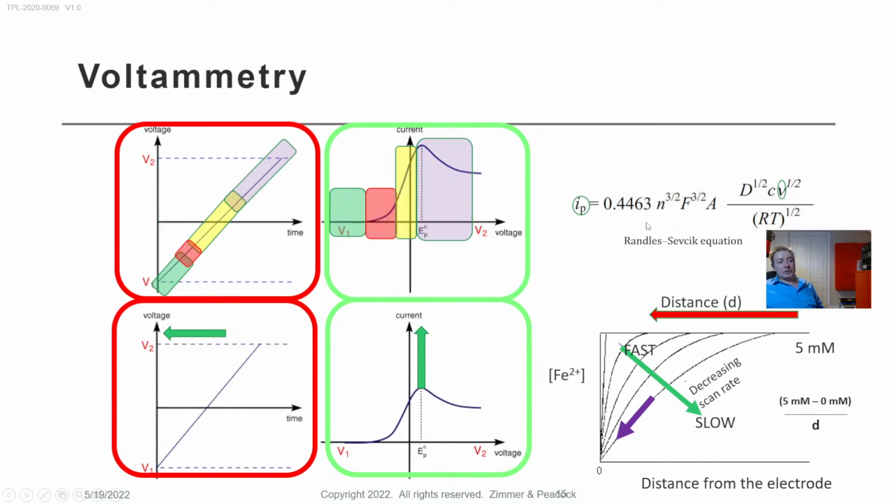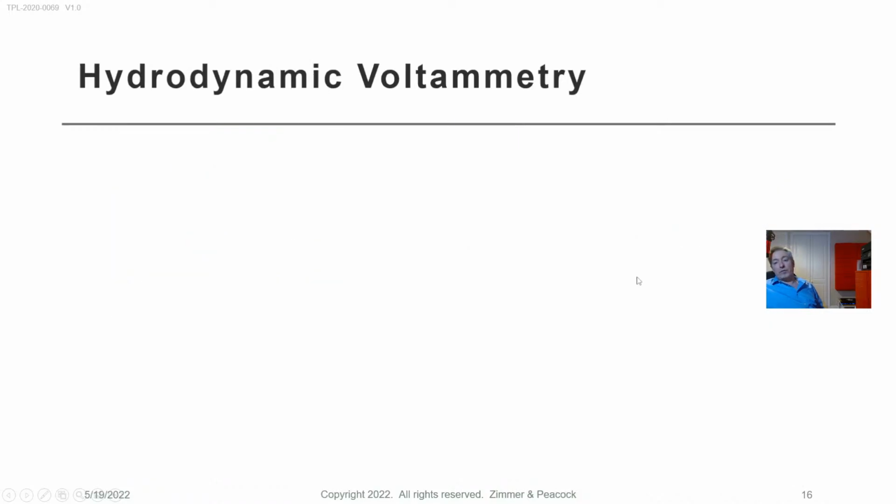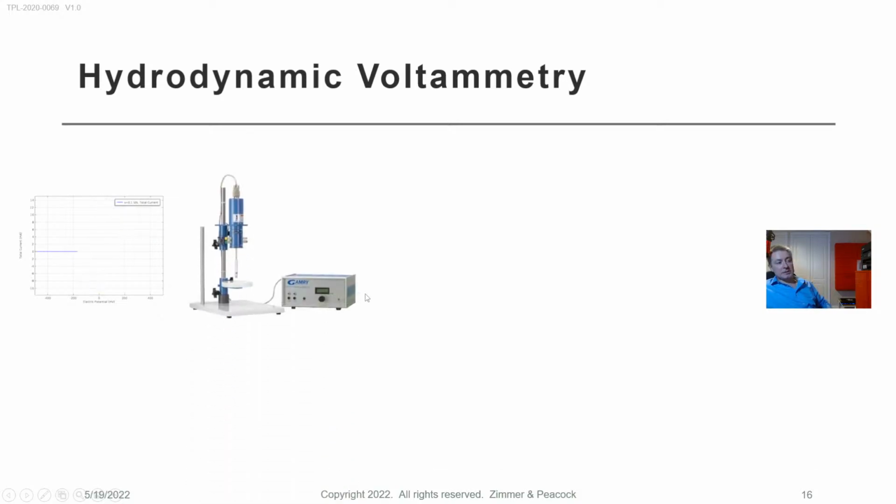Now, electrochemists really think this is super important, and I think it's super interesting, but it's not the make or break in making a biosensor. I also want to put it in context that they do hold cyclic voltammetry very importantly. There's another form of voltammetry called hydrodynamic voltammetry. I've just explained the shape of this CV. In hydrodynamic voltammetry, you use a rotating disc electrode. I'm not suggesting everyone goes out and gets a rotating disc electrode. I actually think it can be a distraction to a biosensor developer. I did my PhD using rotating disc electrodes. I've owned rotating disc electrodes. I just don't think it's important for biosensor developers.